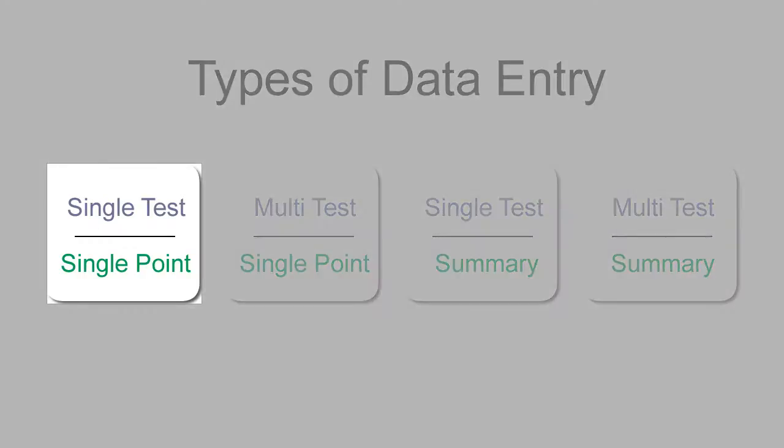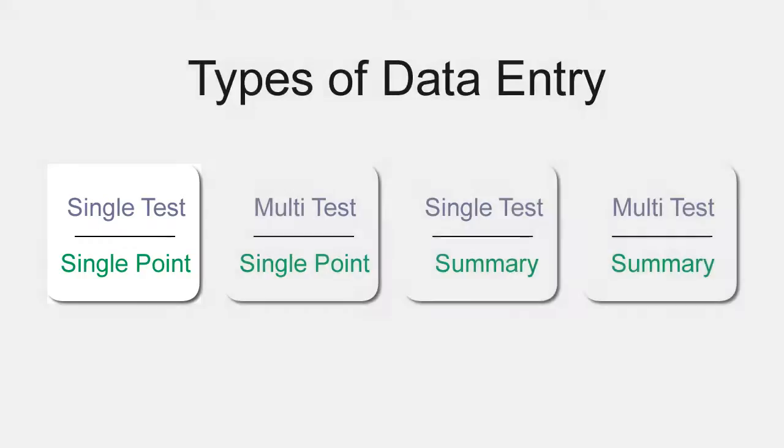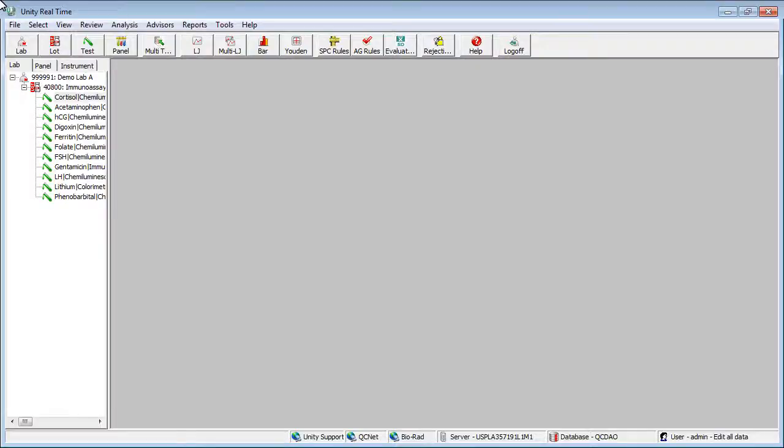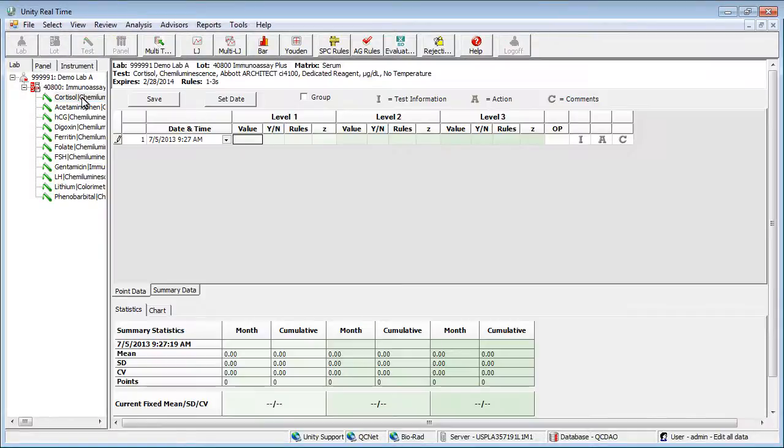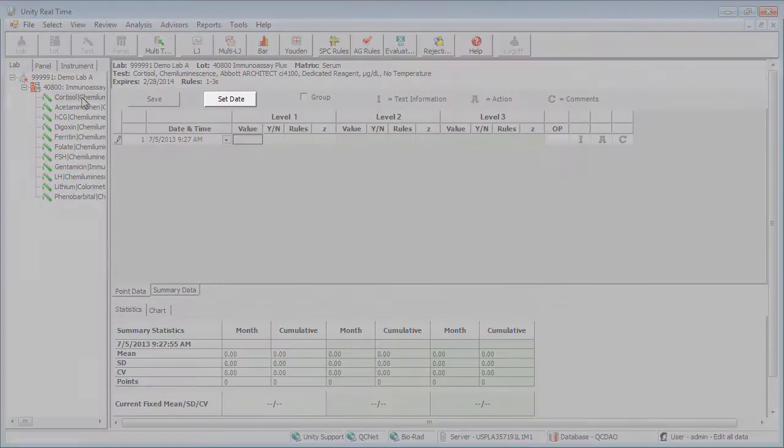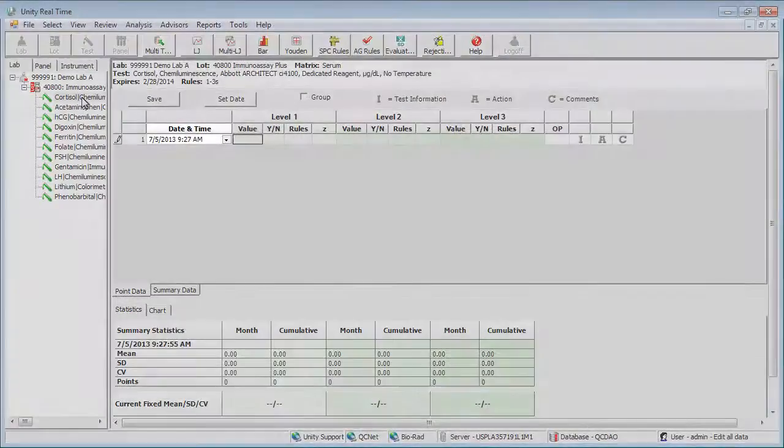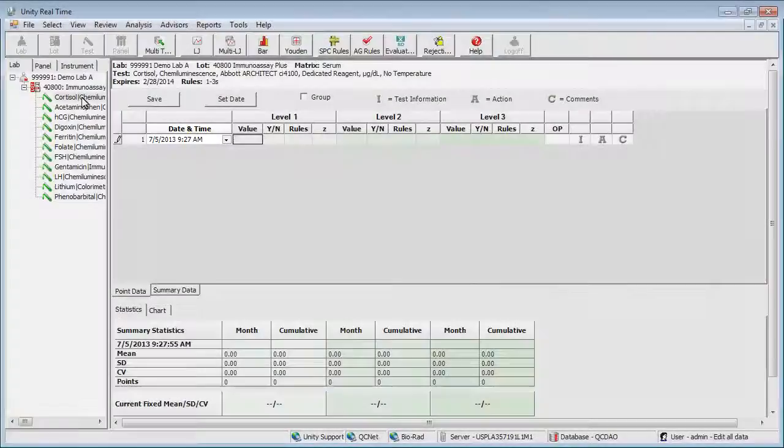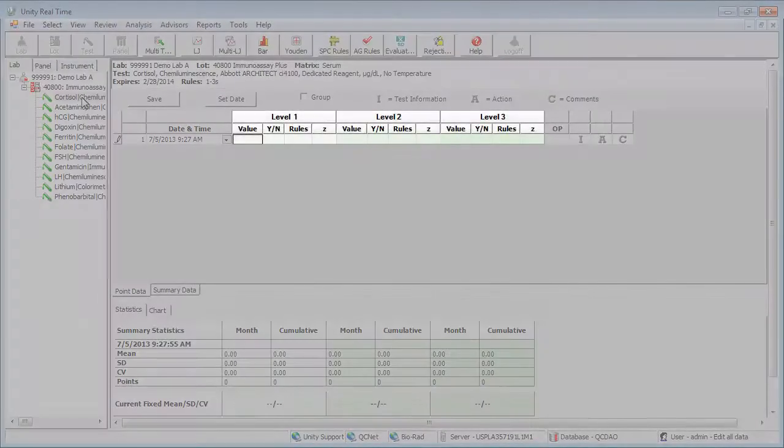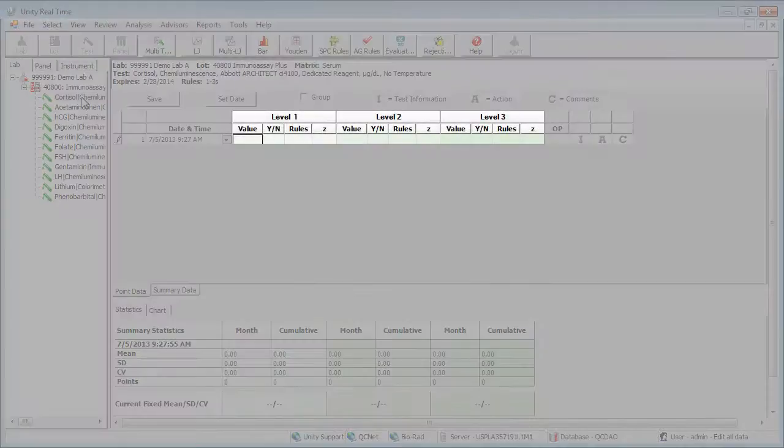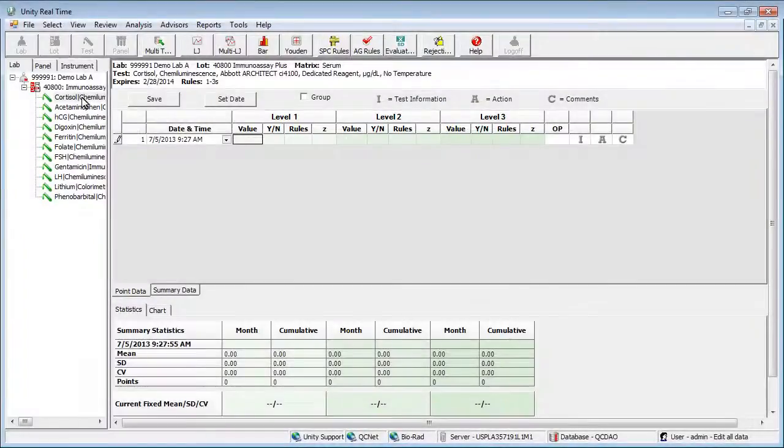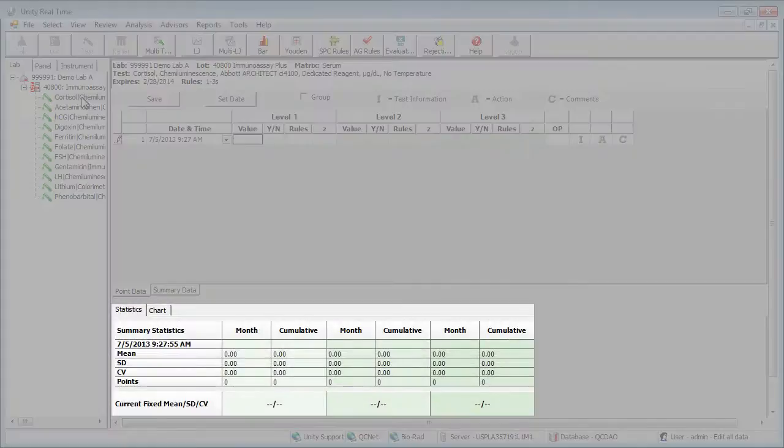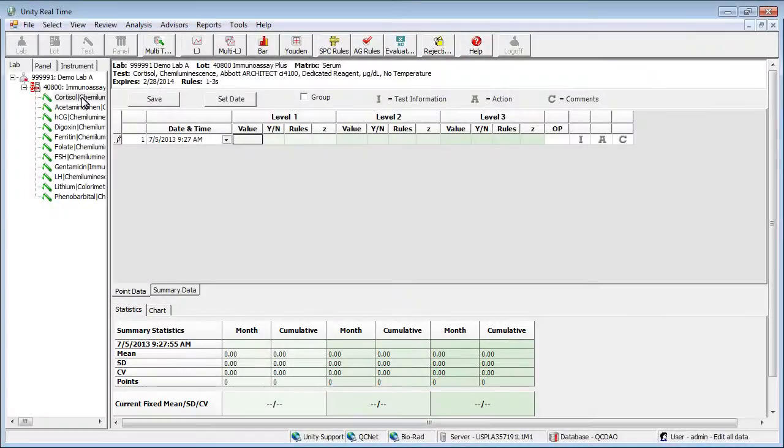Let's take a look at our first option. Double-click a test to open the data entry screen. The data entry screen appears. Here you are able to select a date using the set date button or the date and time field. Data is entered here. Cumulative statistics and charts can be accessed here.